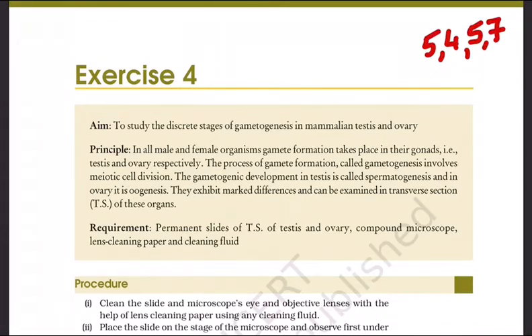Third, identifiable features. What is it that you can identify under the microscope or with the naked eye. Fourth, conclusion. Based on that, what is it that is given to you. So these are the things that we expect. And you have this 2 plus 2 plus 3. So out of these, it may be that one is a specimen, another is a slide, and one more maybe a specimen. So one plant specimen, one animal specimen, and one slide.